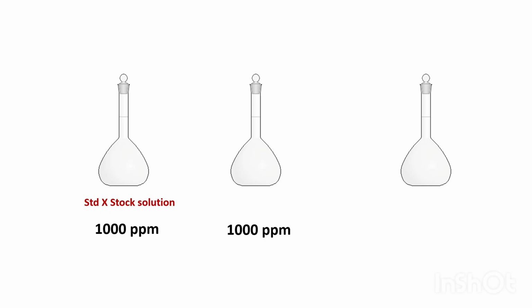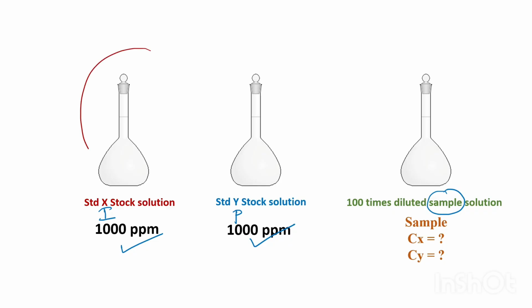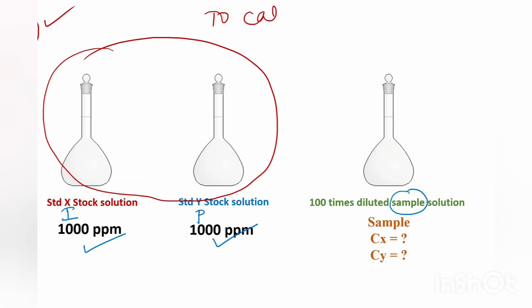In the lab, what will you find? You will find three such flasks: the standard paracetamol stock solution, the standard ibuprofen stock solution X, and the 100 times diluted sample solution. Before we proceed, you should know the role of these standard solutions here, which is to calculate absorptivity.